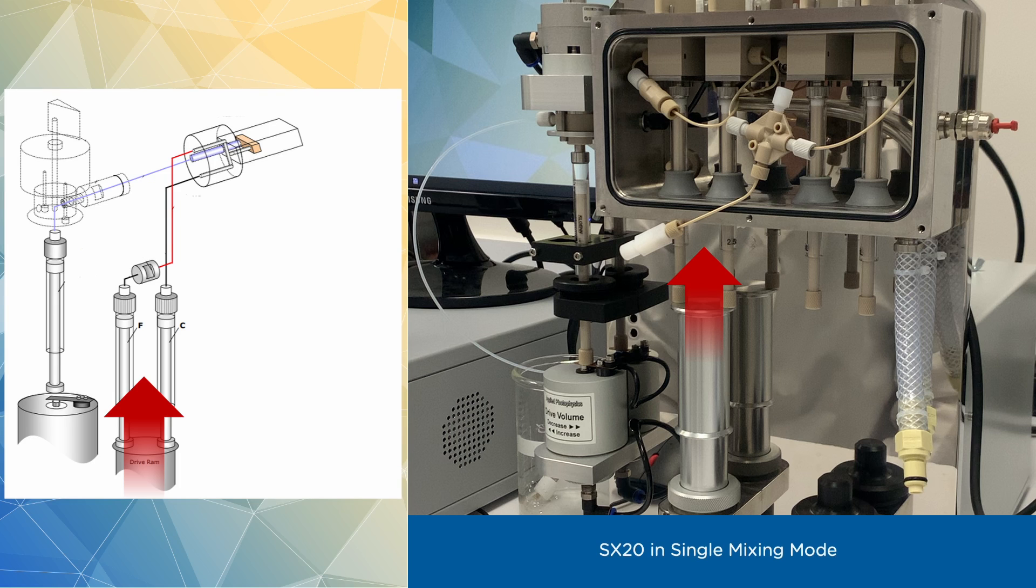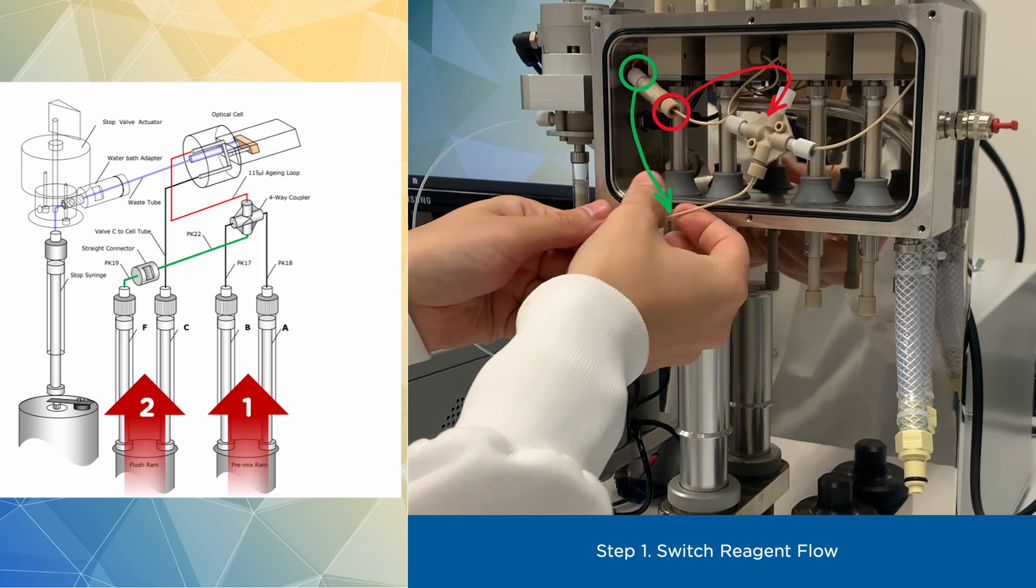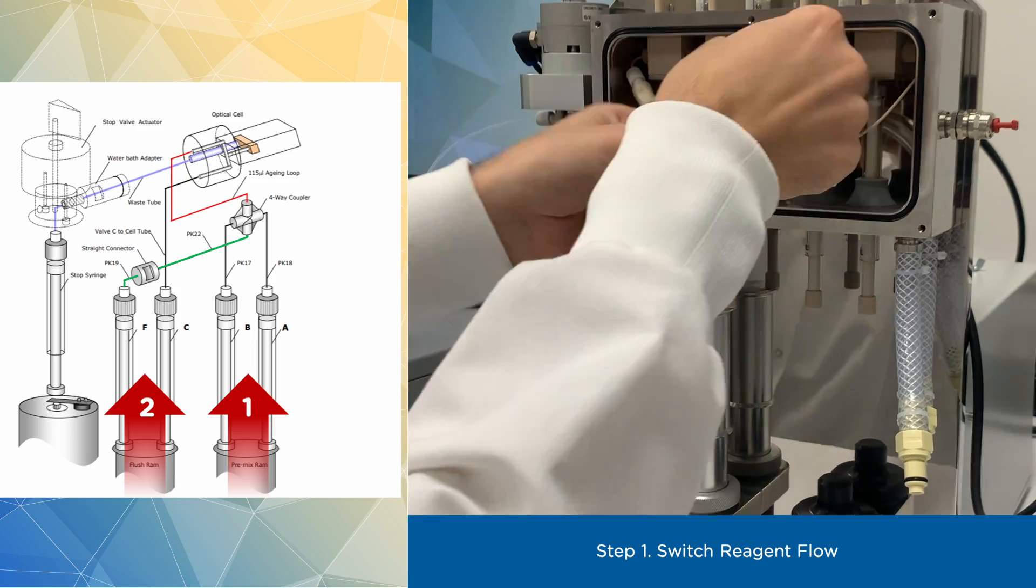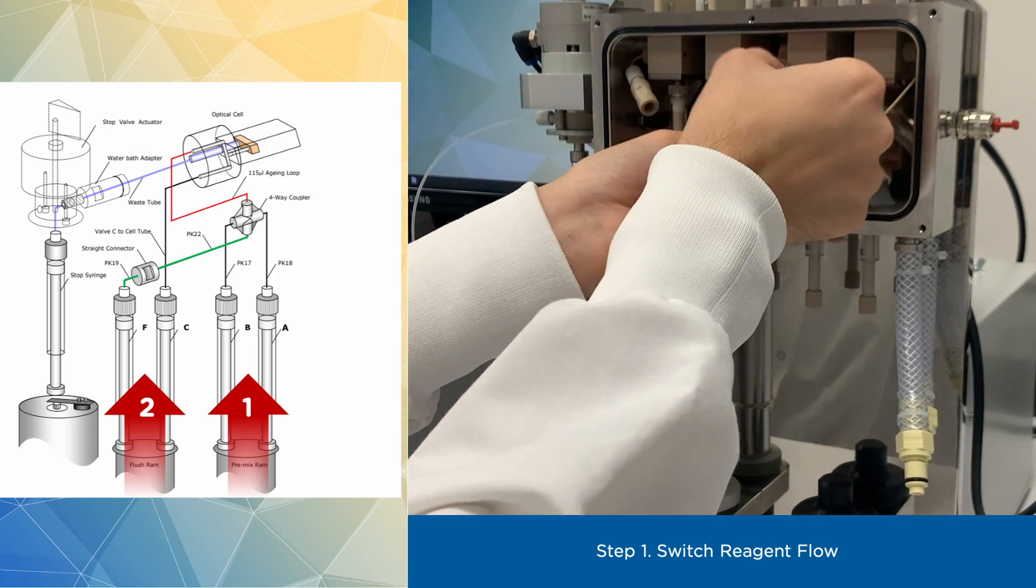Here is our instrument in a single mixing configuration. To switch to sequential mode, just follow these basic steps. First, switch the reagent flow by disconnecting flowline from the leftmost syringe and attaching one end to the top of a 4-way connector and the other end to the bottom.